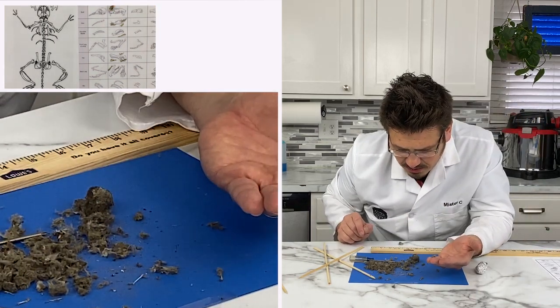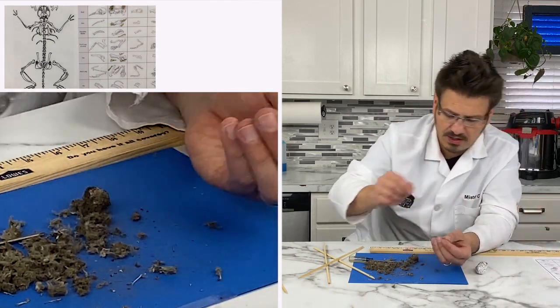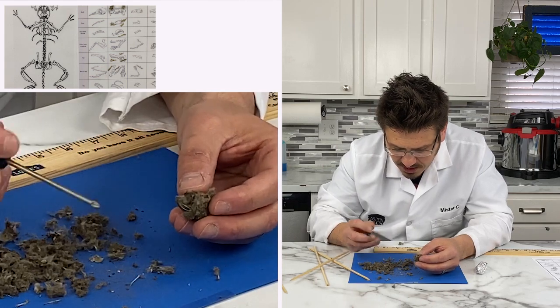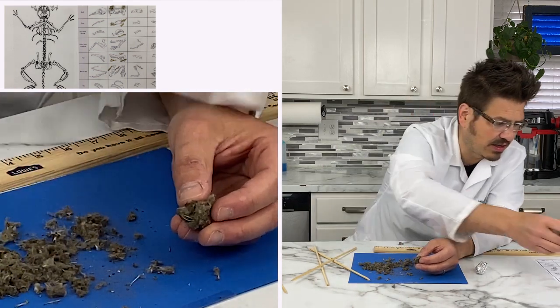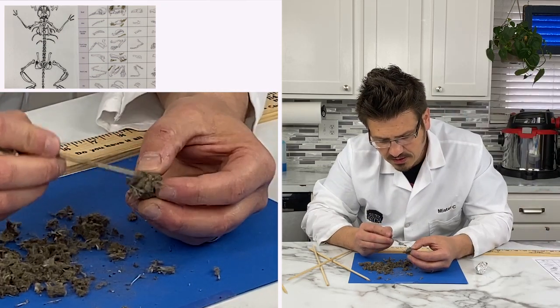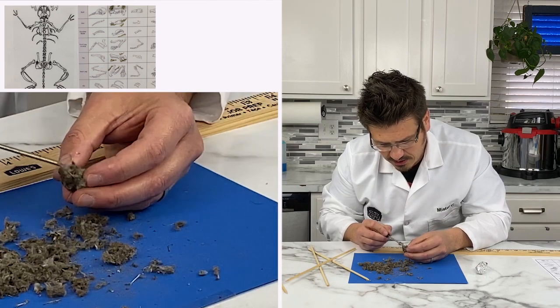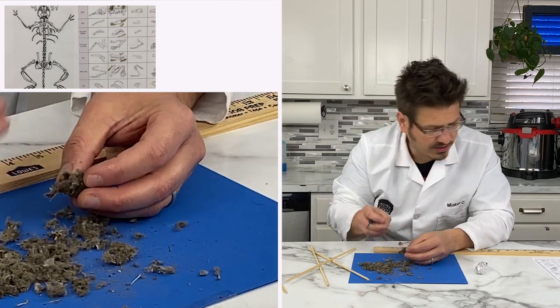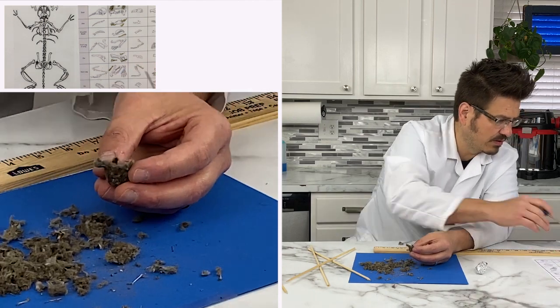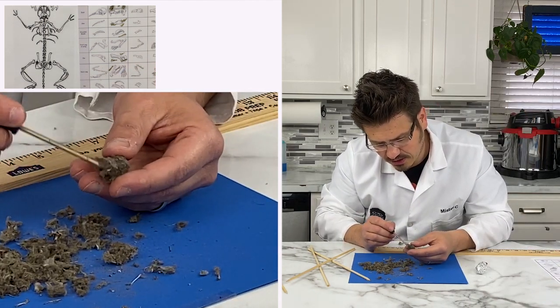Oh, where did my other jawbone go? I'm missing a jawbone, so let's keep digging. I have this big part of this pellet here. Here's some part of the skull right here. I'm just going to set it over there. Let's bring this back here. Got all these ribs. Tons and tons of ribs. Oh, is this an... There's no way that this is another skull.